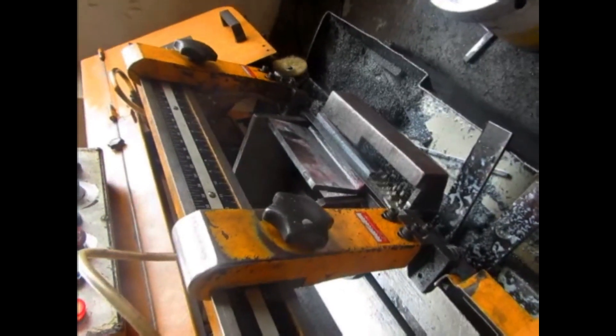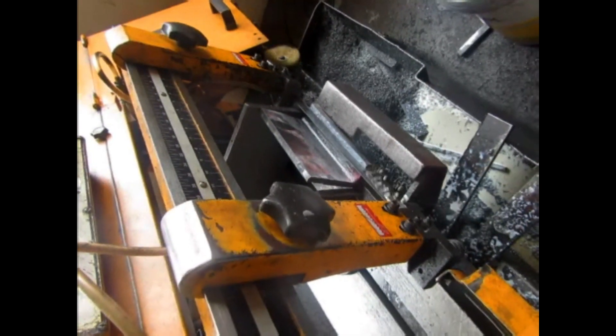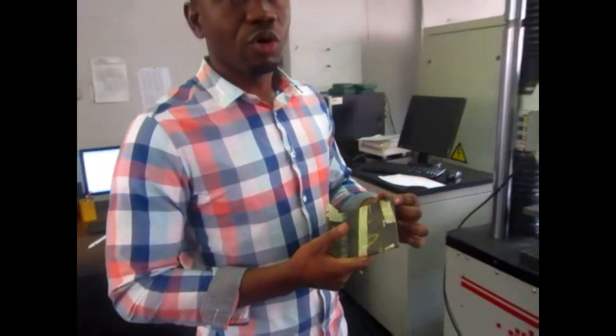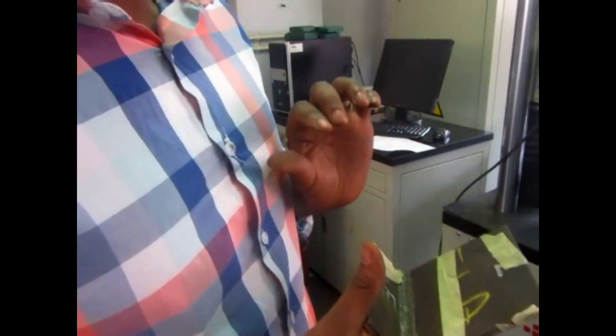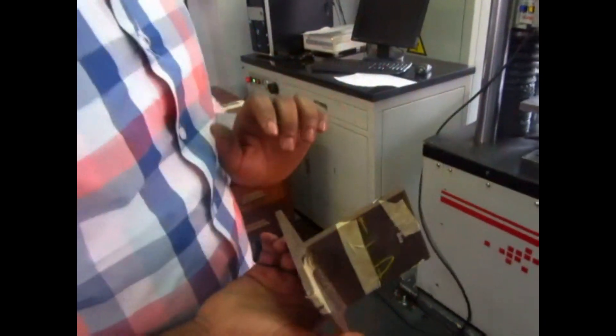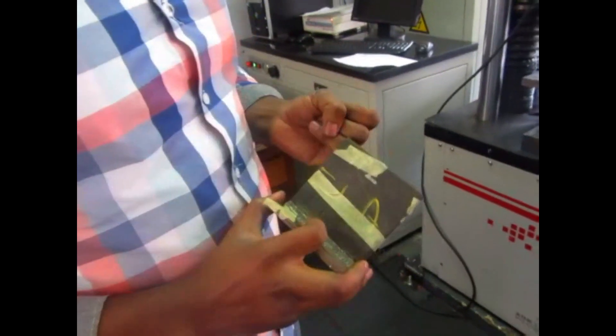In front of you, you can see the sample being cut and then the sample being prepared. We're going to go into the lab and proceed with the test. We've seen how we prepare our sample prior to testing, and this is the sample which was prepared for fracture testing.